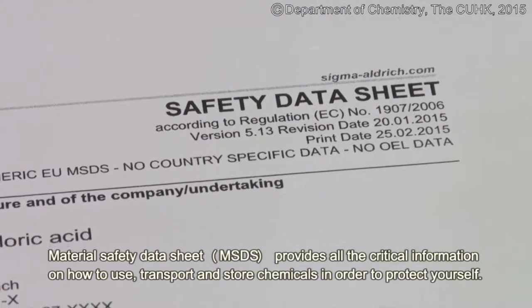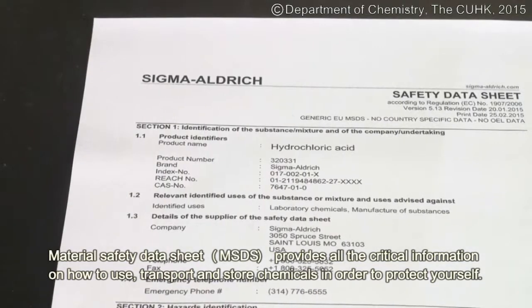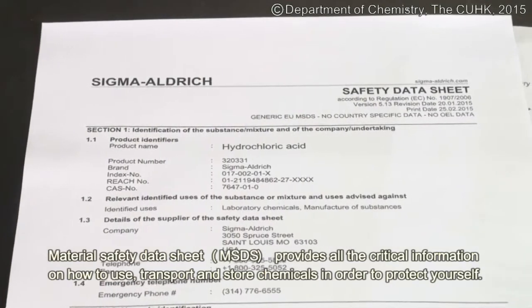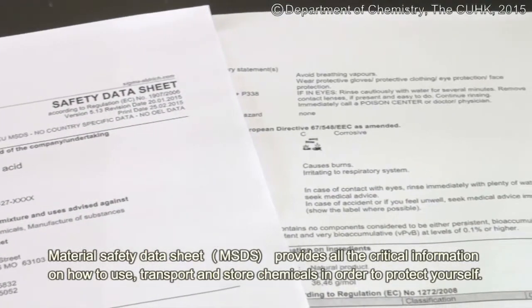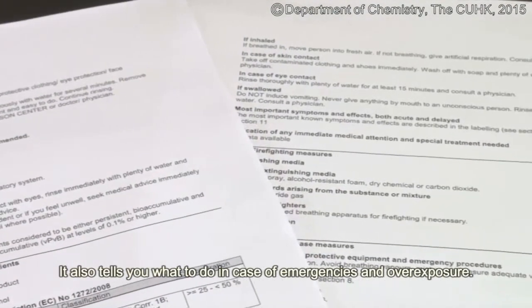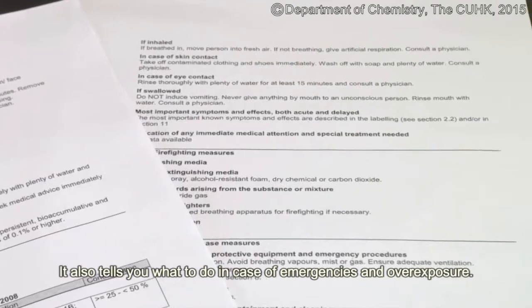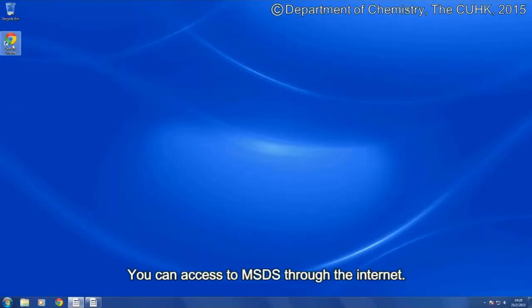Material Safety Data Sheets, MSDS, provide all the critical information on how to use, transport, and store chemicals in order to protect yourself. They also tell you what to do in case of emergencies and overexposure. You can access MSDS through the Internet.